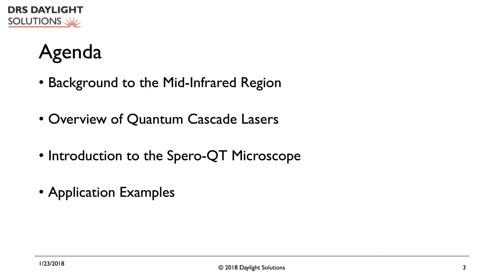In today's webinar, we're going to share with you a short background on the mid-infrared range, gathering spatial and chemical information in many applications with the Spero microscope. But first, I'm going to share with you two slides with spatial and chemical information collected on tissues, solids, and liquids.